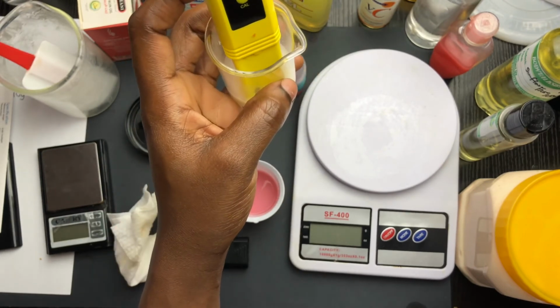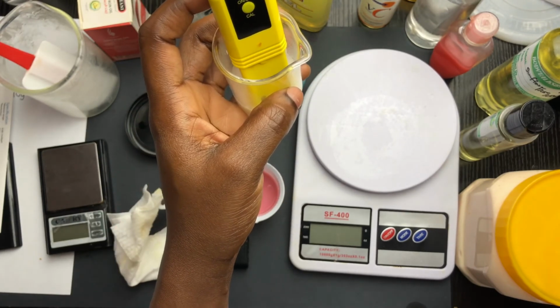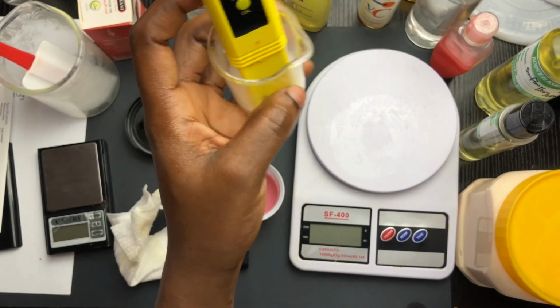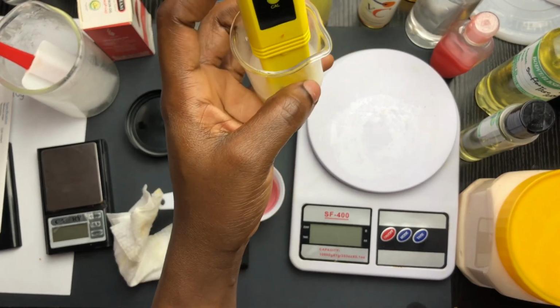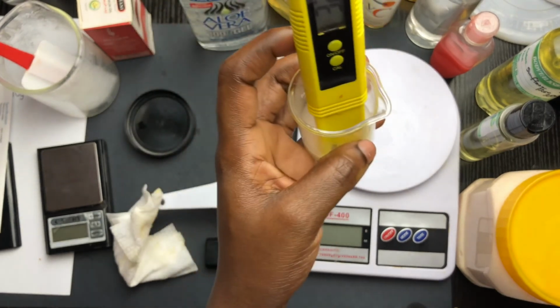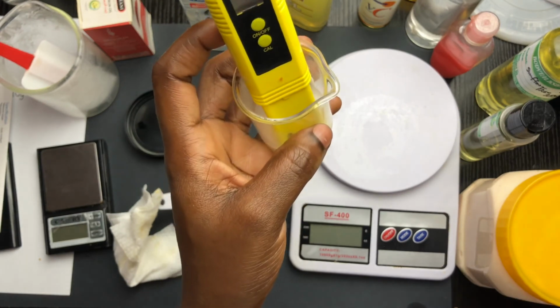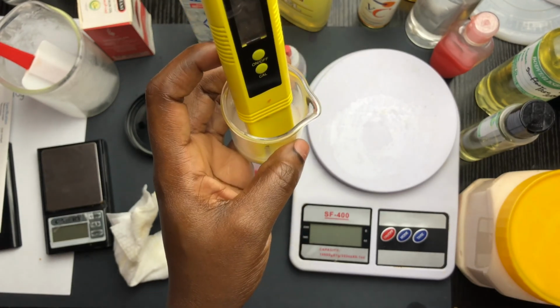For this, I did 10 grams of my products and 90 grams of water to test the pH of this product. You can also choose to put this directly in the product, but that takes a lot of cleaning and rinsing and all of that, and so I wasn't feeling up to that.